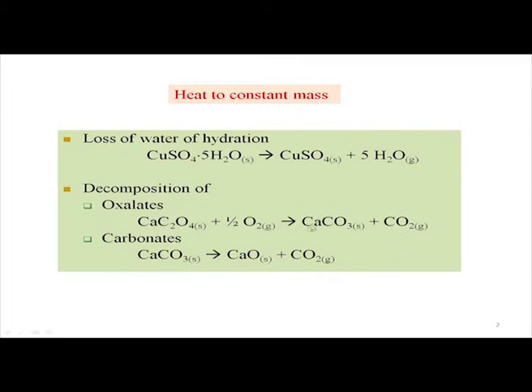Otherwise, what we find in absence of oxygen, or in presence of some inert gas like nitrogen or argon, is that carbon monoxide can come out. So, that carbon monoxide coming out from the sample of calcium oxalate is a well known fact, and that will give rise to a different kind of weight loss compared to the heating of the sample of calcium oxalate in presence of air or oxygen.